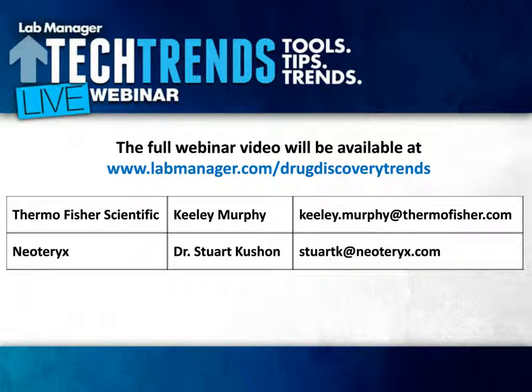Okay, thank you. Keely, can the Q-Exactive Focus run MS/MS experiments as well? Yes. There is a collision cell, and the ions are transferred to the collision cell before they're analyzed in the Orbitrap mass analyzer. Typically, for our quantitation experiments, we do not need MS/MS unless we have a very complex sample matrix. For the most part, we achieve great quantitative results with just our SIM experiments. But when you do have more complicated samples, the option is there, and you can run a typical MS/MS experiment.